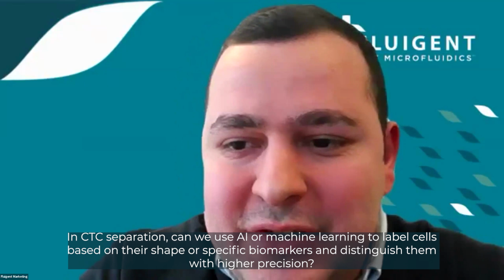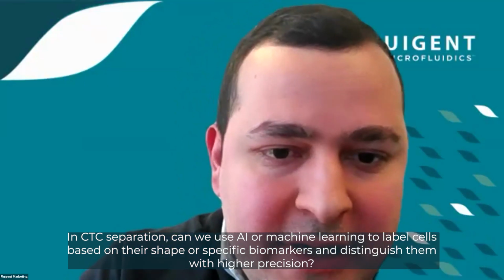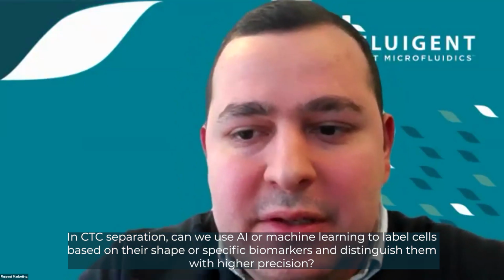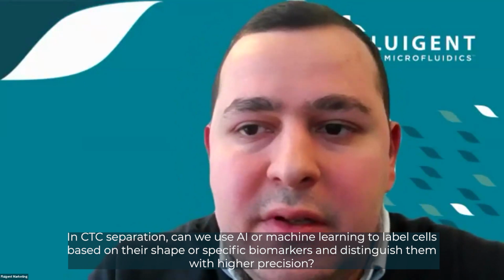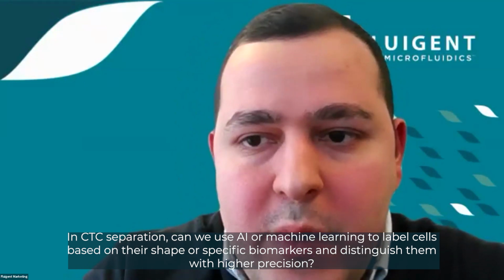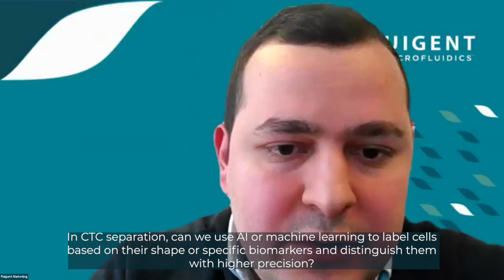So there's a limited space to optimize, but each cell depends on its mechanical properties, and the size requires slightly different conditions. Another question that is a little bit trendy now: in CTC separation, can we use AI or machine learning? How do you see it? How can we incorporate this technology into our diagnostics, for example, for specific biomarkers, and distinguish them with high precision?